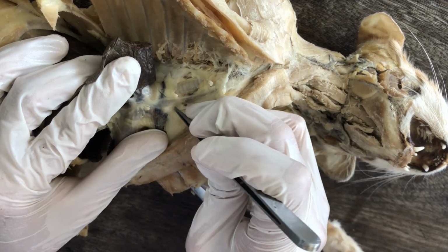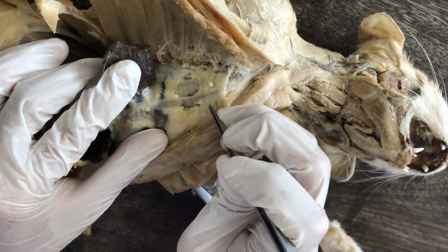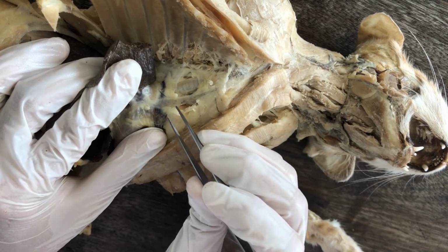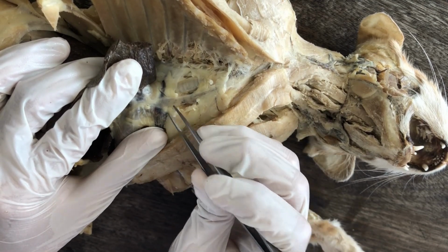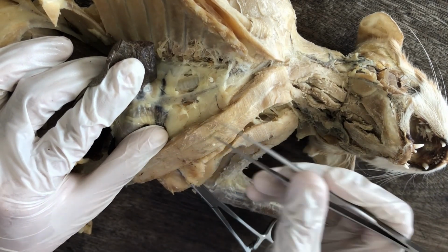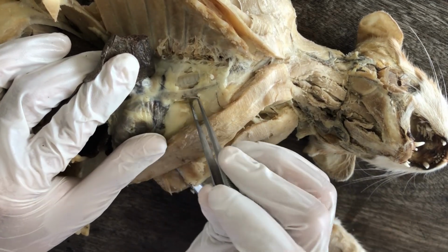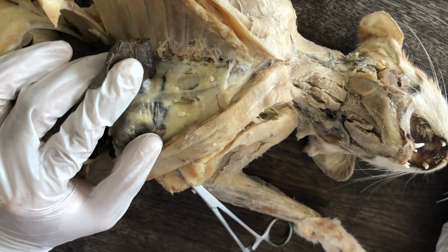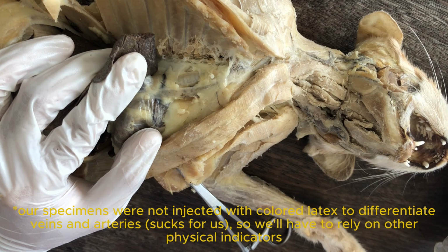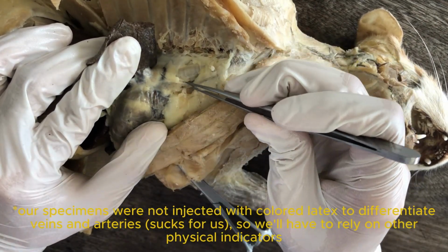And ventral to it is a plastic-like tube. So what's difficult about veins is that when you dissect them, when we go to the circulatory system, they're very thin. Veins are typically thin-walled compared to arteries. And so in our specimens, they will look kind of like fascia or connective tissue at first if you're not trained to see them. So it's like a thin-walled plastic tube. But this is a vein.